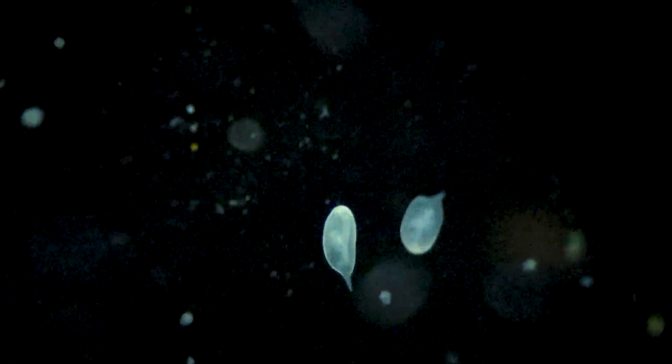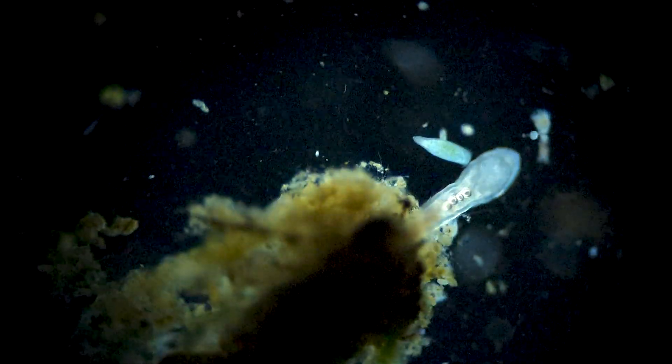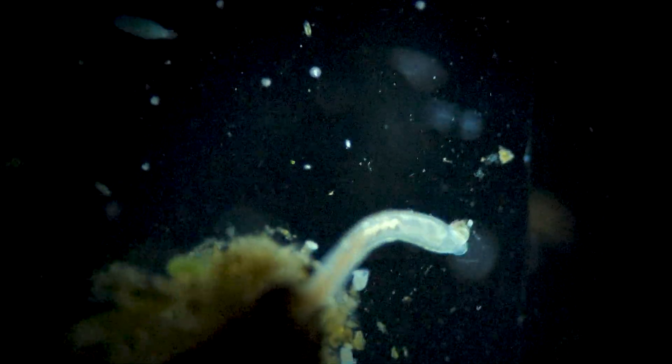Dark field microscopy is where you block the light directly behind your sample, but still let the light pour in from the sides to light it up, and that's how you get these really cool images that I'm showing you here. This is pond scum under dark field microscopy. And then of course there's Journey to the Microcosmos, which is by Hank Green. But honestly, I really like Oliver more.